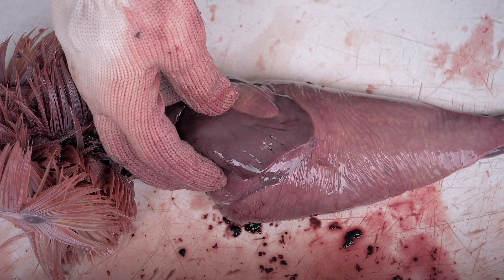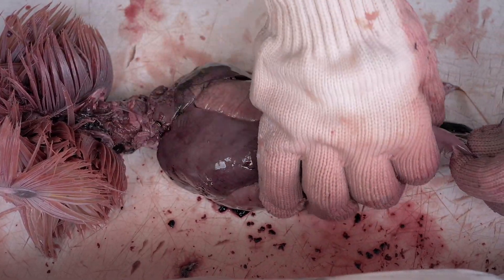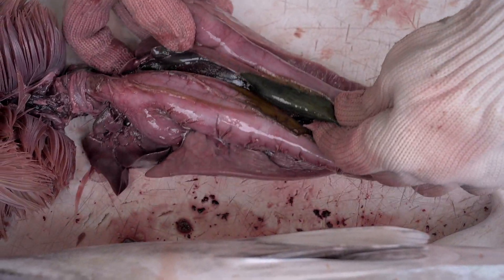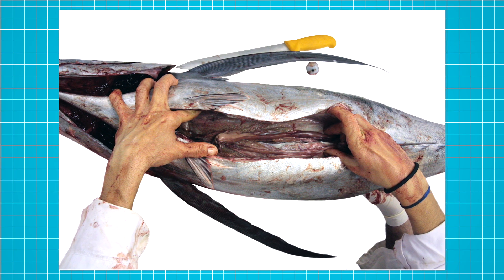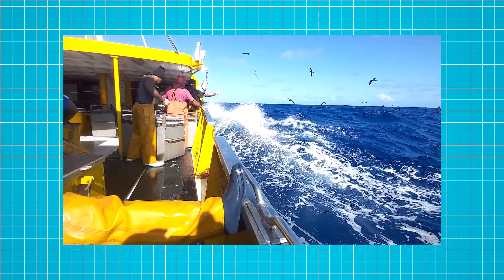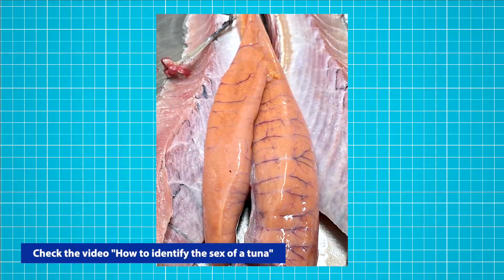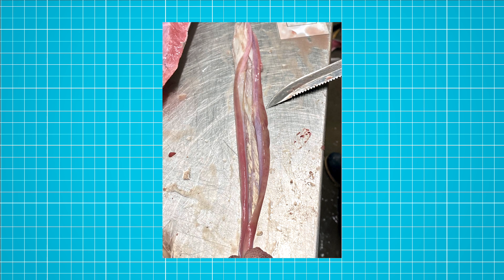Here you can see the liver, which is darker and has a butterfly shape. Then the digestive system — not yet the stomach. The intestines, and then the stomach is just here. And if you're lucky, the gonads are still attached to it. Sometimes the gonads will stay with the guts; sometimes they remain inside the fish, especially if the fish is very large. On board longline vessels, you will catch tuna larger than 70 cm, more likely 90 cm. At that size, for a skipjack for example, they are already mature with large gonads. If the tuna is not yet mature, the gonads are too thin and stay stuck against the backbone of the fish.